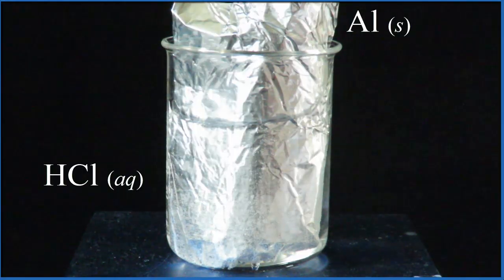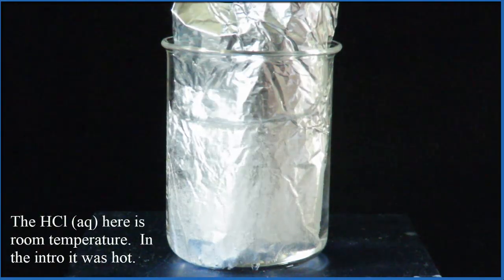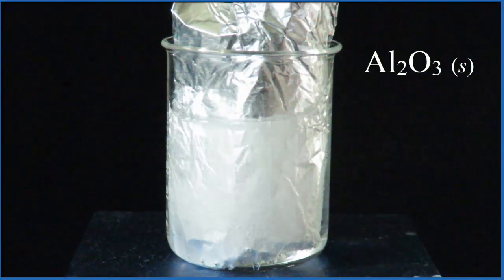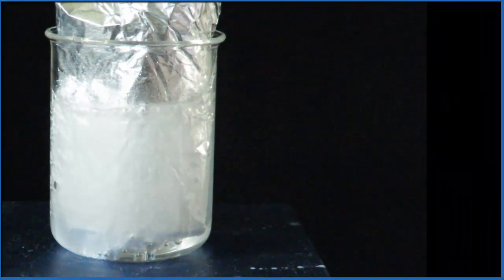We put the aluminum in the hydrochloric acid and nothing happens right away. That's because aluminum is coated by aluminum oxide, Al2O3. Once we break through that aluminum oxide barrier, the reaction starts. It's a single displacement reaction - the aluminum replaces the hydrogen, so we should end up with aluminum chloride and hydrogen.